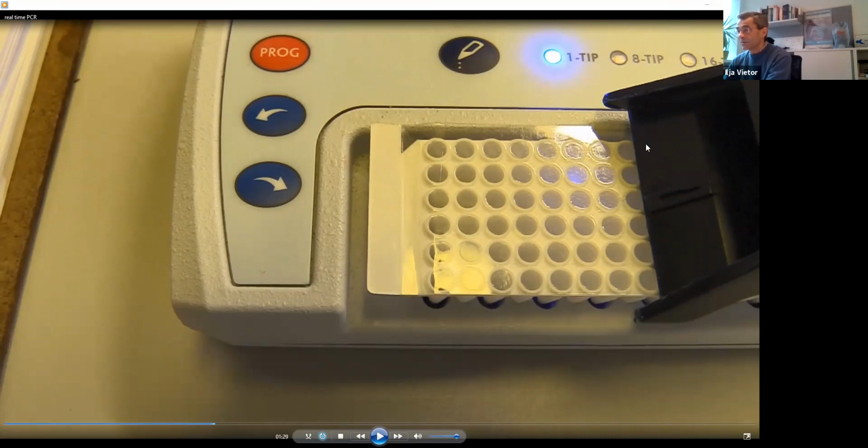And then we have a small plastic device with which we seal it properly several times. On one hand, it has to be closed. On the other, it's very important that it's really clean, because during the reaction the PCR instrument is reading the signal from this probe, which is a light signal. And if you have some dirt here, that would affect the result.